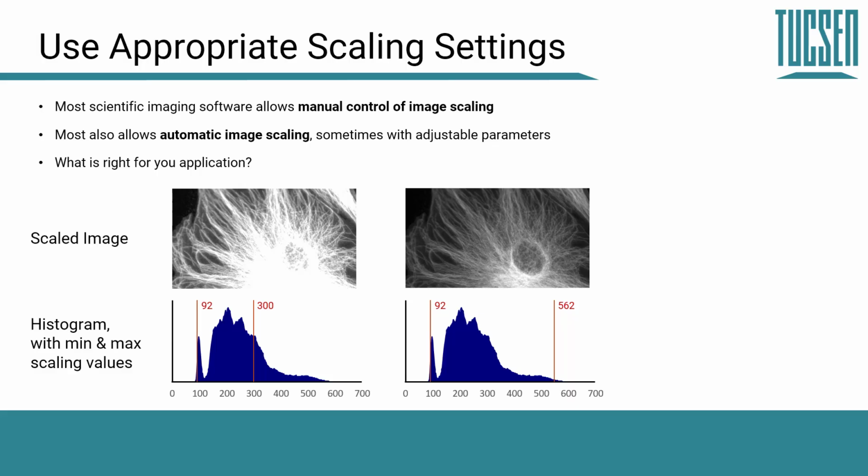This is because there are bound to be many pixels in the image which have really quite high values due to the random variations of noise within the image. And these highest values can fluctuate quite a lot from image to image. For example, in one image, one pixel might have a value of 700, and then in the next image in a sequence it might be 650.